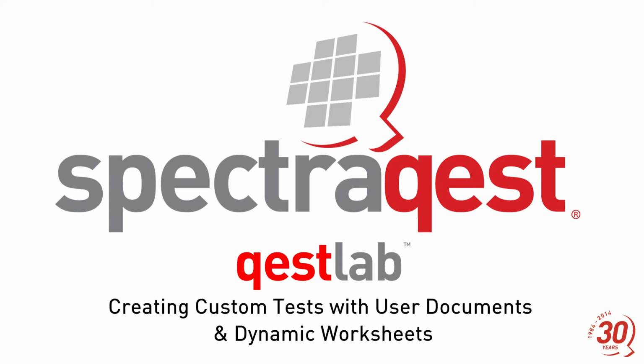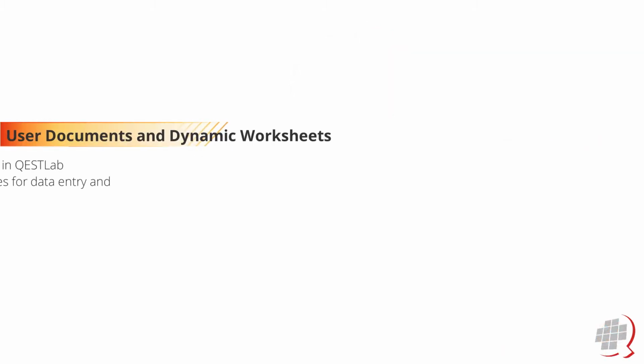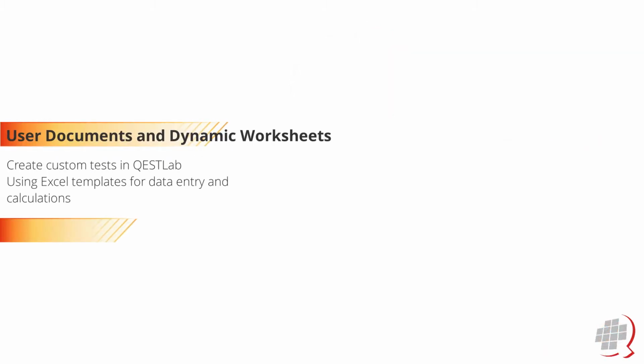User documents and dynamic worksheets are incredibly powerful tools in QESTLab that allow system administrators to create their own tests utilizing Excel templates for data entry and calculations.